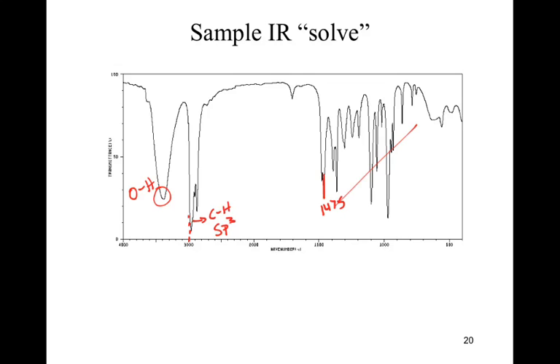So again, we see this spectrum with a whole bunch of different signals, and the only thing I really evaluated was 2 sets. We even have a signal up in here. Very weak though. Nothing on my list suggests something weak in that 1700 range. If anything's going to be there, it's going to be that carbonyl real strong. So again, keep it simple, keep it quick.